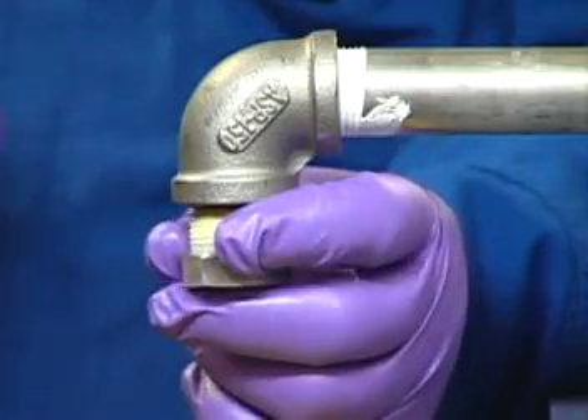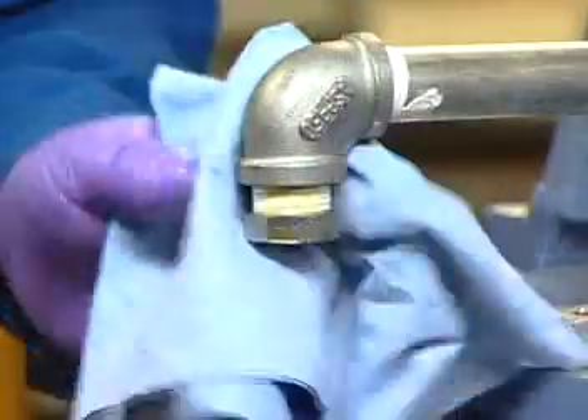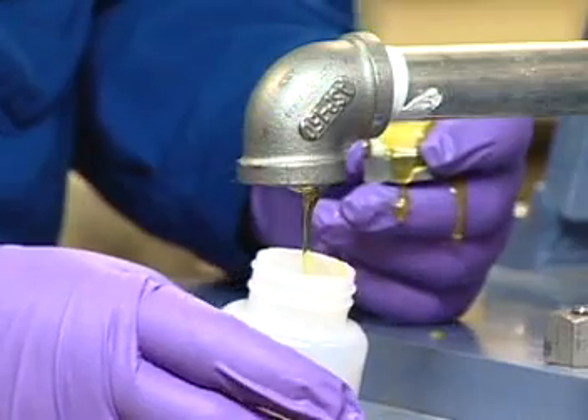The fourth sampling method, and the least desirable, is sampling at the tank or oil pan drain. Before sampling at the drain, carefully clean the area around the drain plug. Take the sample after about one-third of the oil capacity has been drained.